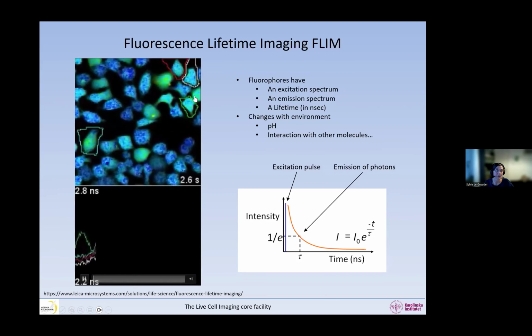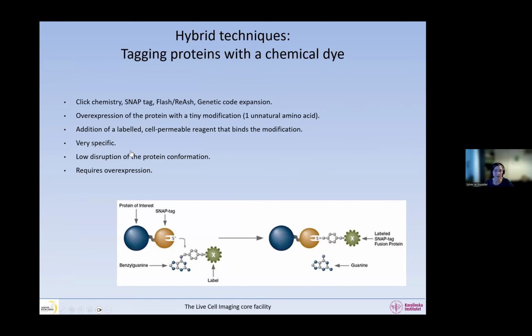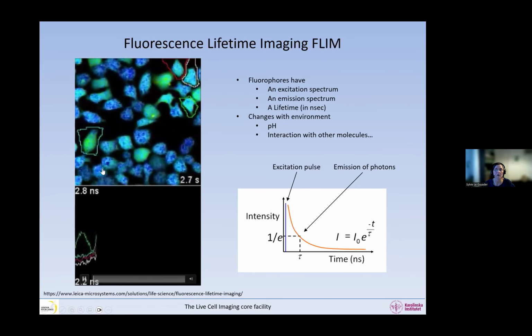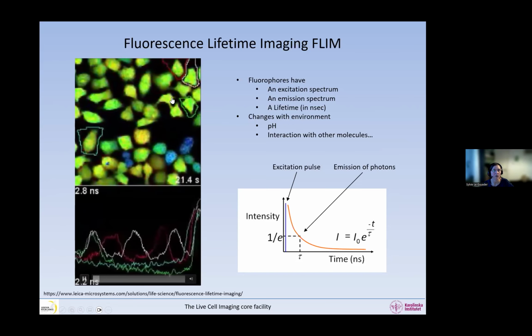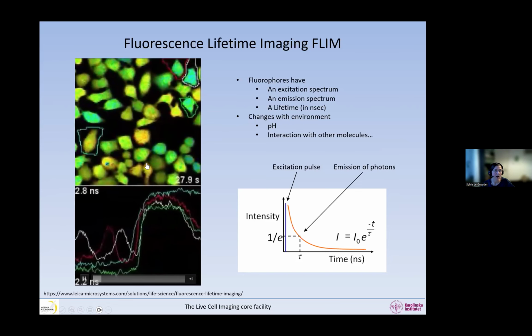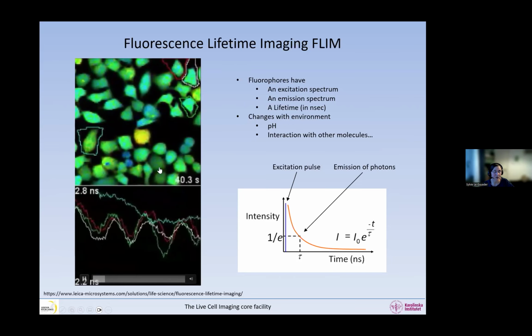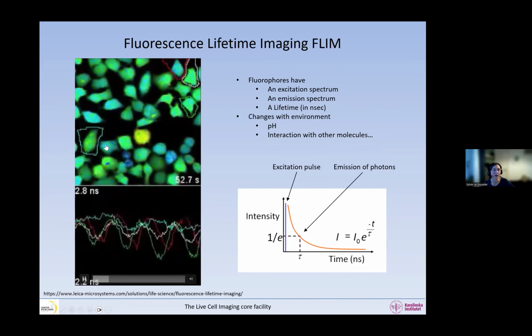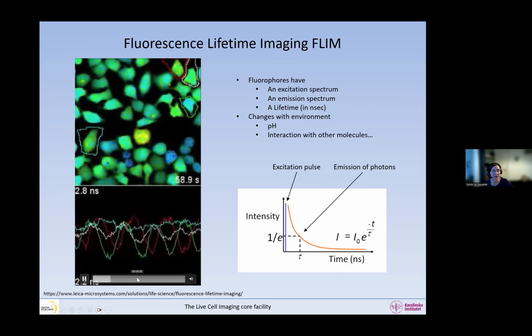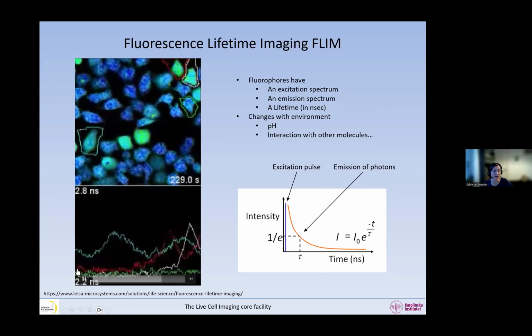And in this example, we can see, I forgot what the fluorophore is, but I think this is a calcium sensor. And what we can see is that when we send the pulse to these cells, then they suddenly get a completely different color. It's actually not a color. This is color-coded. This is the change of lifetime of this fluorophore. And then slowly it will go back to blue. Okay, so it will go back to its original lifetime.